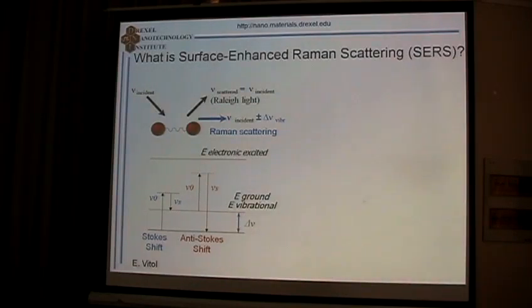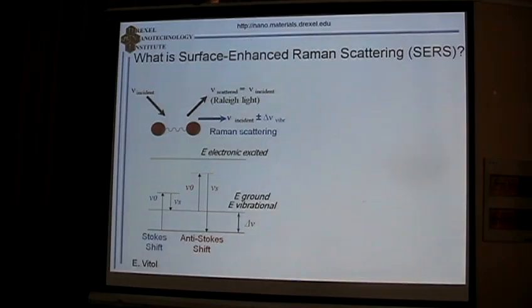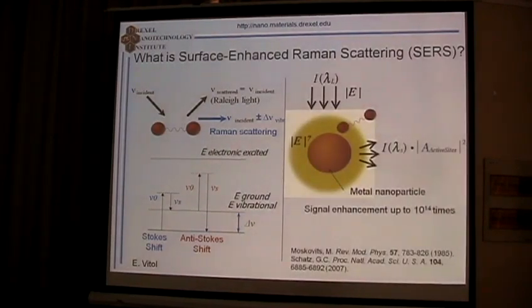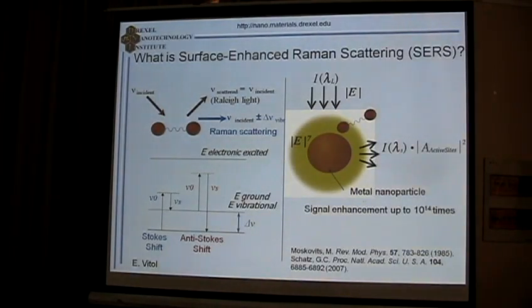Now, switching gears. I hope it gave you some ideas of what can be done by Raman spectroscopy. A few more things about Raman spectroscopy before moving to other techniques. Still, while resonance often helps us, intensity may become not sufficient. So what can be used is a technique called surface enhanced Raman spectroscopy, when we modify the electric field, actually enhance the electric field, by using metal nanoparticles.